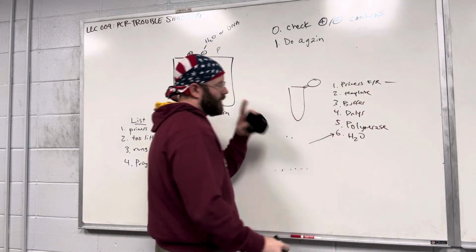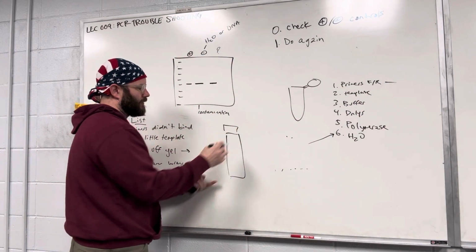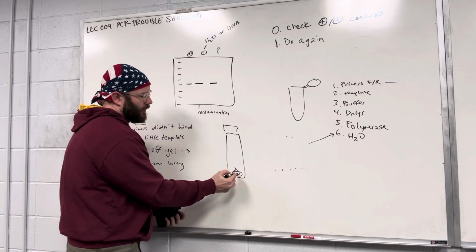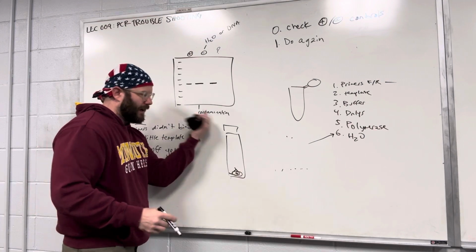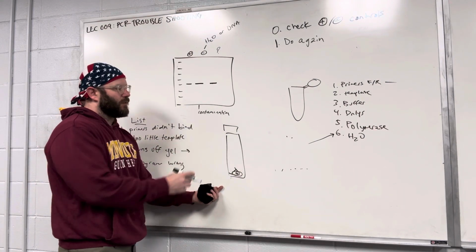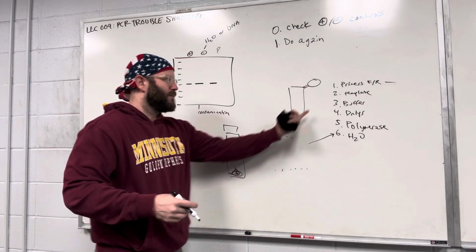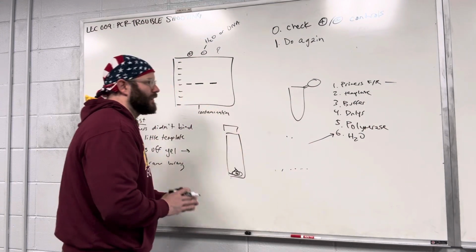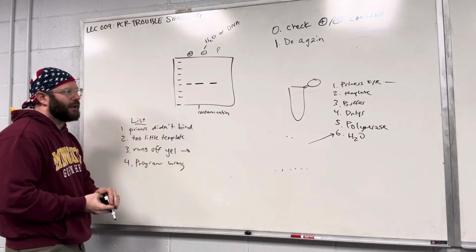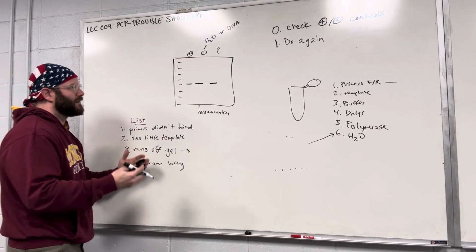Primers often get contaminated. When you order primers after you've designed them, they come in a little tube as dried powder, and then you have to add water to that. A common way people introduce contamination is adding water to their primers from a contaminated source, and then any PCR you run from that is contaminated. So lots of things can get contaminated. Keep that in mind. If you ever see this result, that indicates there's contamination.